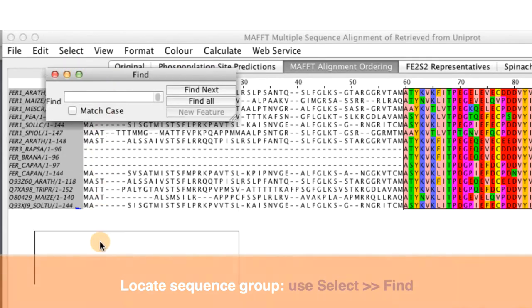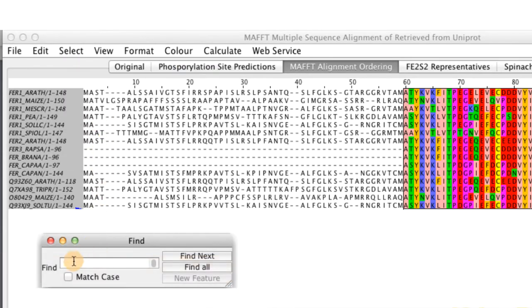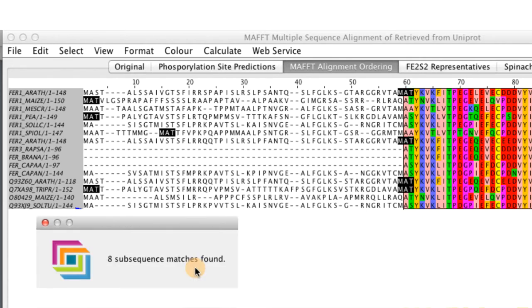In the window that opens type in the sequence that you are interested in. I have selected the MAT sequence. I used find all option and it has identified that motif. You can use the find to locate sequence ID or sequence numbers.